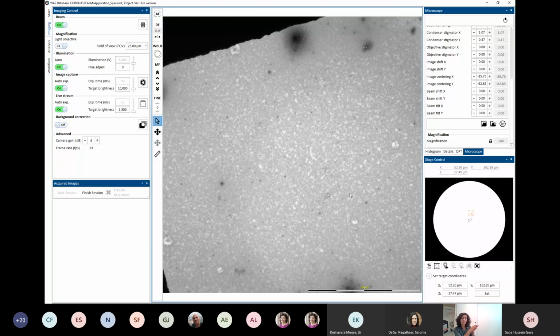And we also have an educational compendium which shows you examples of what good staining or what a good grid square should look like. And what we are looking for is something that is evenly stained. It's not too dark. It's also not too dry or too bright. It's this sort of nice shade of gray. And we have image examples for you guys to look at to make yourself familiarized with what is a good grid square.